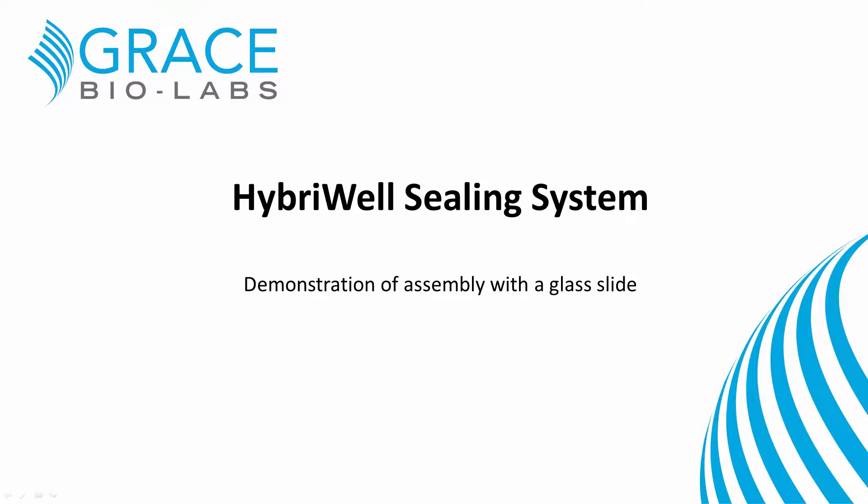DNA amplification, nucleic acid programming, protein arrays, reaction kinetics, neurophysiology, and more. This video demonstrates the use and assembly of Grace BioLabs HybriWell Reaction Chambers with a standard microscope slide.